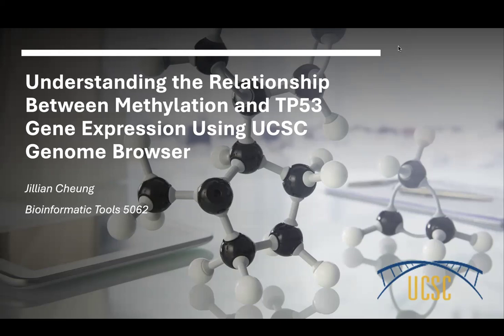In this tutorial, we'll look at the ENCODE project methylation and RNA-seq data, and apply it directly in UCSC, comparing the two cell lines GM12878 and the HeLa S3 cell line.